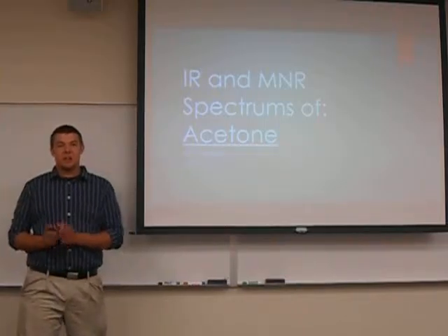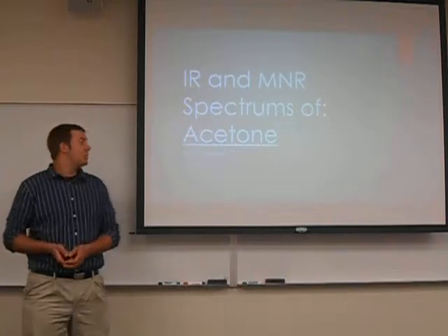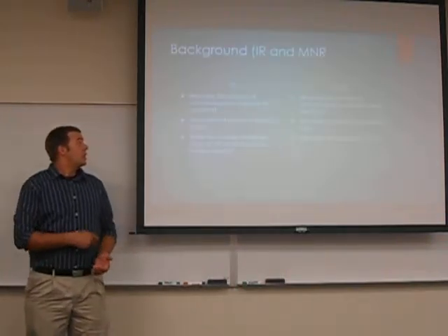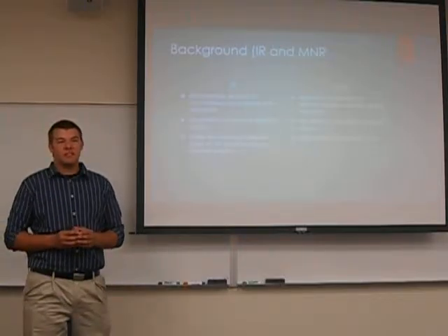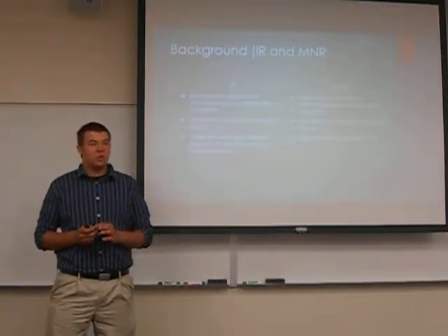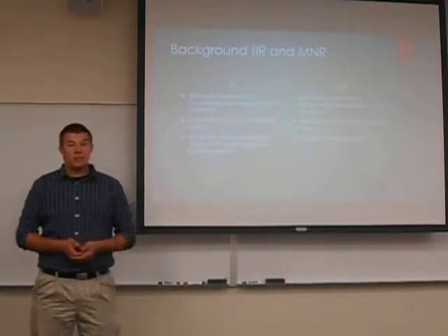My name is Andrew Rieman, and today we're going to talk about the IR spectrums and the NMR spectrums of acetone. Now, the purpose of our lab is to use the IR and the NMR spectrums to help identify an unknown molecule, which today we're going to look at acetone was the unknown molecule.